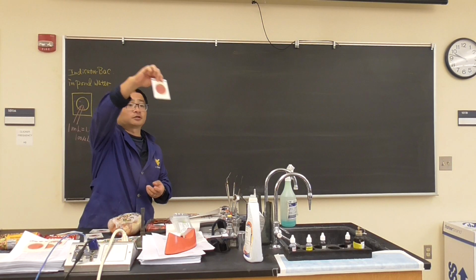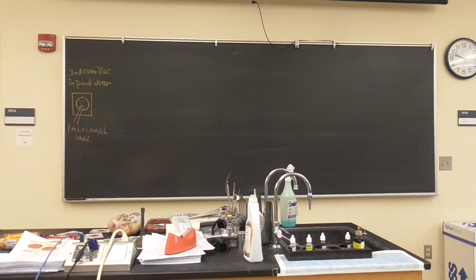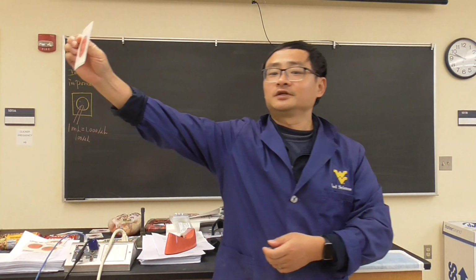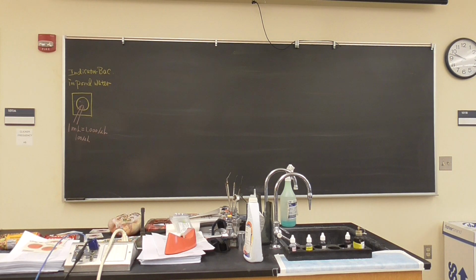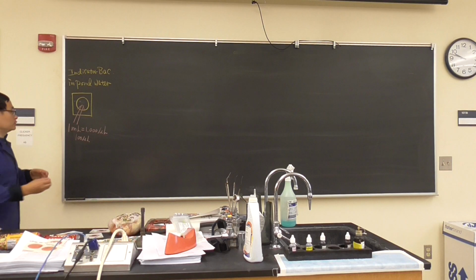And this one looks good. Now what mine looks like, I have one example right here because I didn't throw them away. Mine looks good too. It looks like that. So this is the first thing. It's very important for the petrifilm, but lots of people didn't recognize it. When you see small dots there, the volume is incorrect.